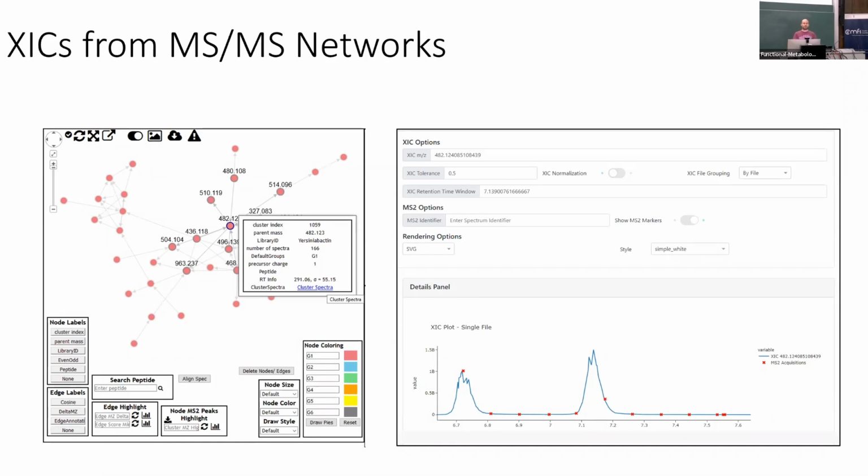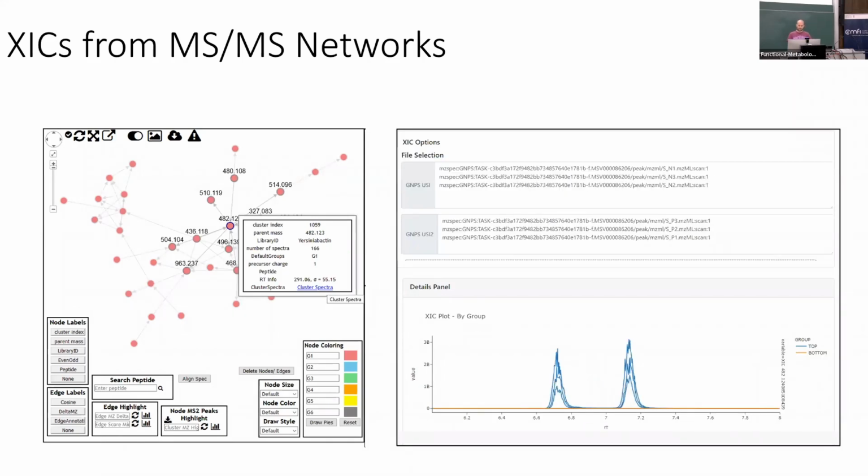So here, perhaps with feature finding before, you would have gotten this as 2 nodes, but I think the nice take-home message here is that with classic molecular networking and quickly inspecting it, the expert sees, oh yeah, there's more behind it. And that's how I think you should see any result of that, right? Always, before you write a story about Yersiniabactin in your paper, look at the raw data. And in the following session, we want to do that a little bit and actually look at some of the raw data of the molecules that you found interesting in the test data you used.